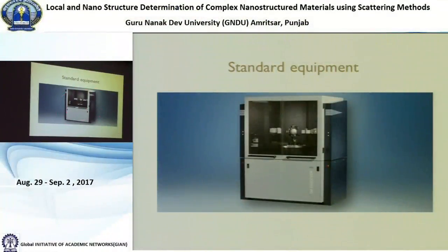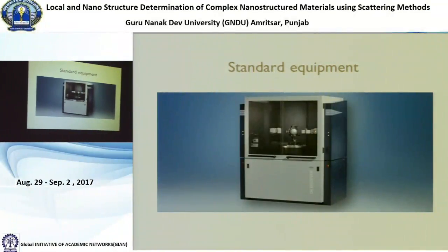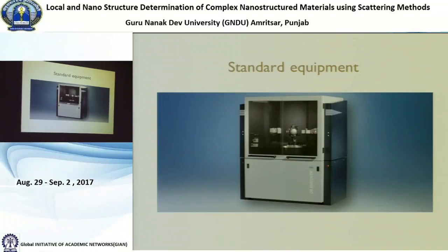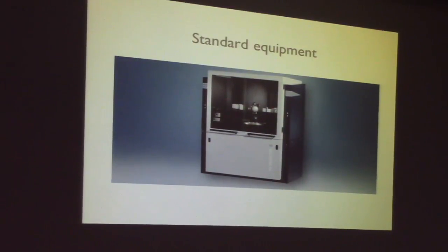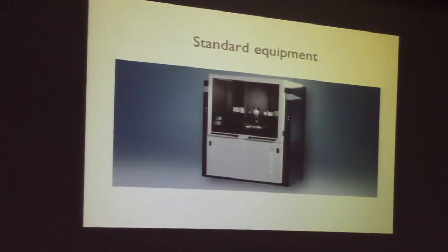So this lab equipment, you basically take a wallet full of rupees and you go and talk to the instrument manufacturer, and they'll deliver it and install it, and then you can start using it. They'll teach you how to use it. They're very anxious to sell you X-ray equipment. If you're very bold, you can build your own equipment. You have to be quite careful though, because X-rays are dangerous. So it's definitely preferred that you buy this, either some new or used version. But it will fit in your lab. You need a fair amount of power to run it, and you need water to cool it.